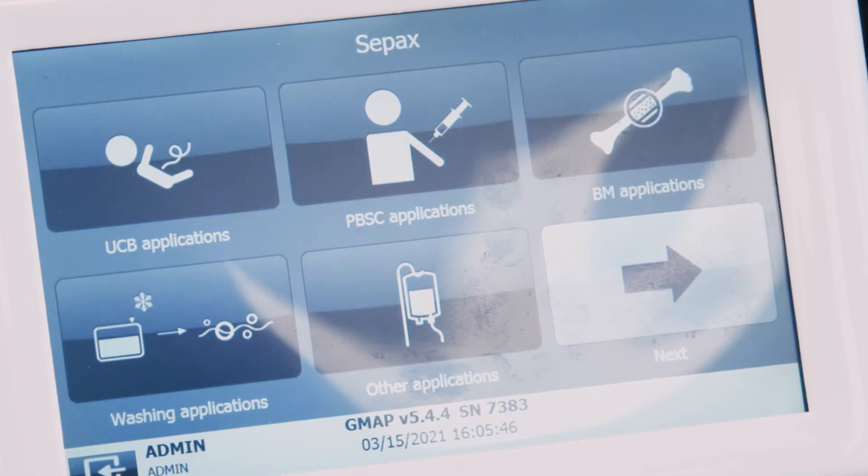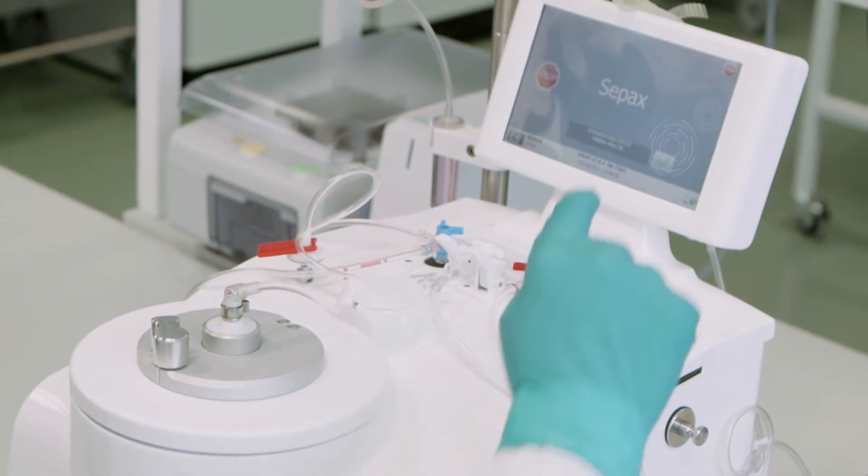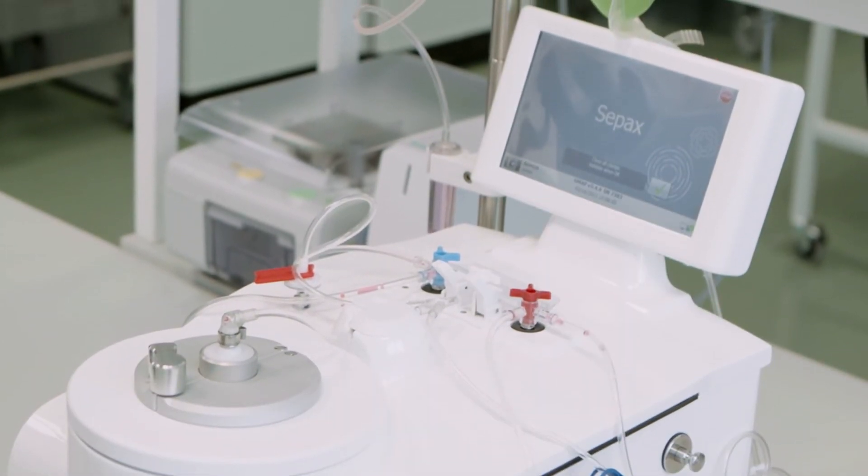CultureWash offers user-friendly, flexible processing, and customizable parameters, and the ability to work with a wide range of both initial and final volumes. When using this software, you can harvest and wash a high quantity of cell-based products, accommodating initial volumes up to 1.2 liters.